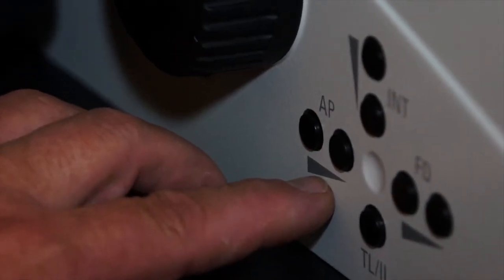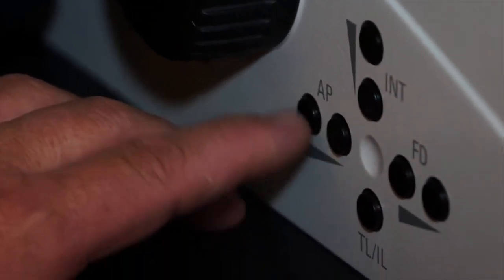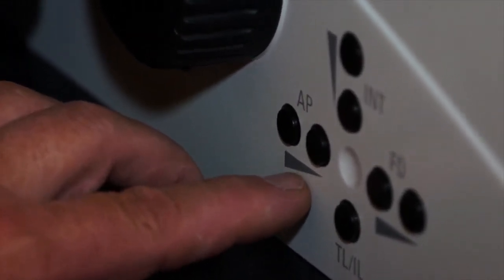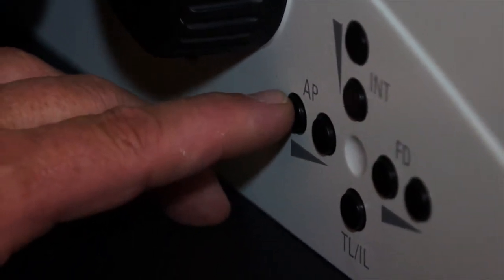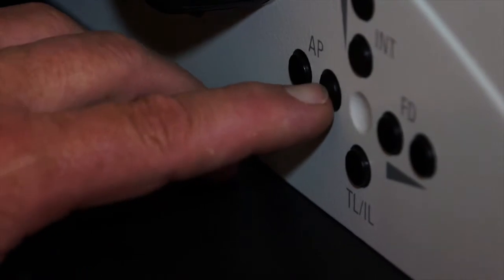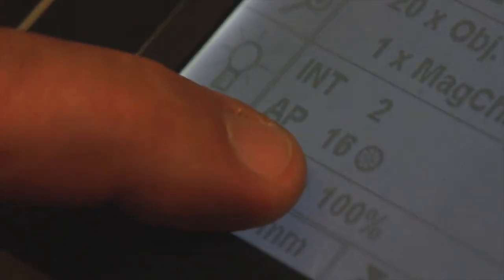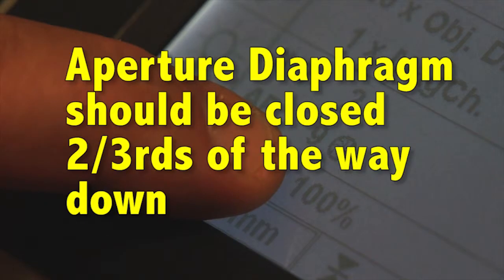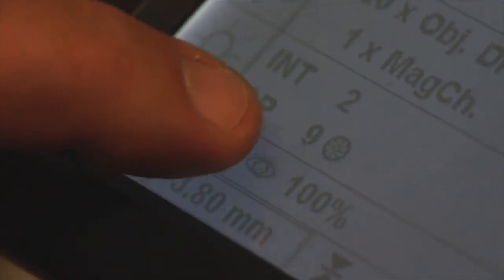As discussed previously on the upright compound microscope, we have an aperture diaphragm in the system. The aperture diaphragm gives us contrast and depth of focus, and can be increased or decreased in opening by actuating these two buttons. On the illumination line of the screen, the aperture diaphragm and the size of its opening are displayed. The aperture diaphragm should be closed two-thirds of the way down. We will show you momentarily how to look down the tube of the microscope to know where your aperture diaphragm should be set.